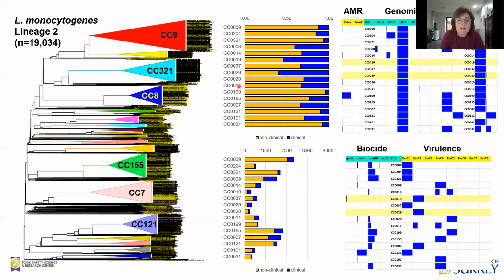Just a question from Malik in Melbourne. He's saying that SMEs are not really in a position to afford expertise in whole genome sequencing technology. So, how can it help the food industry manage food safety? I think they can't have somebody specific for it. They could train, of course, staff in it, but it depends on how much staff turnover there is, whether you have to retrain people regularly.